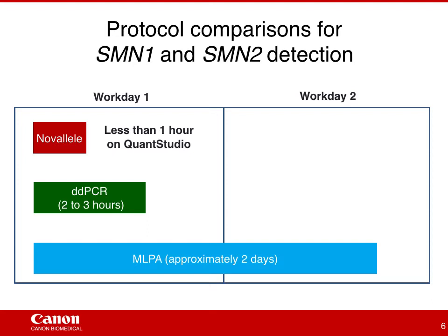MLPA is a 2-day workflow due to the lengthy hybridization step. In addition to the long protocol, MLPA also requires that the lab have access to a capillary electrophoresis system in order to generate the data.